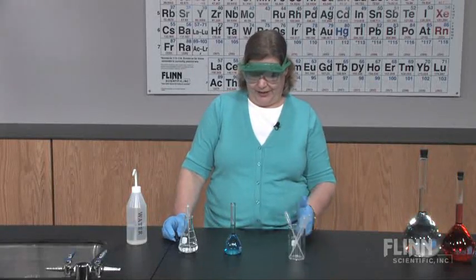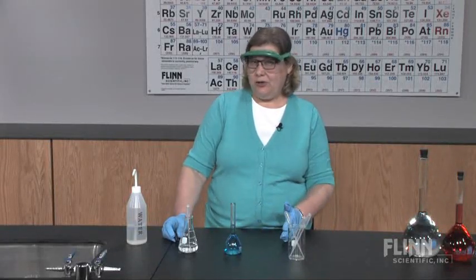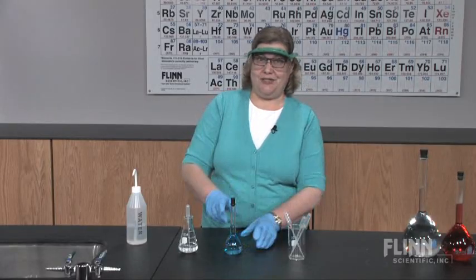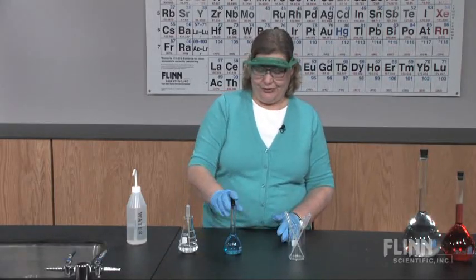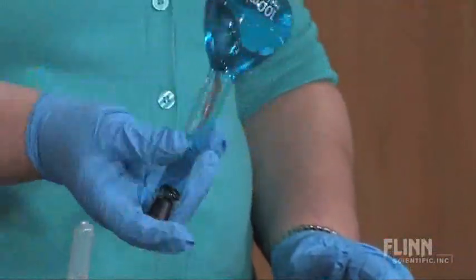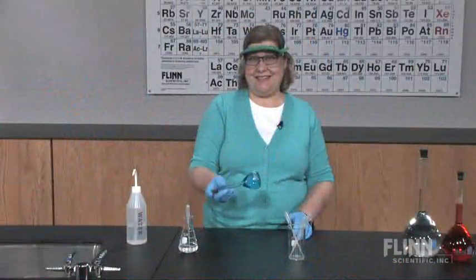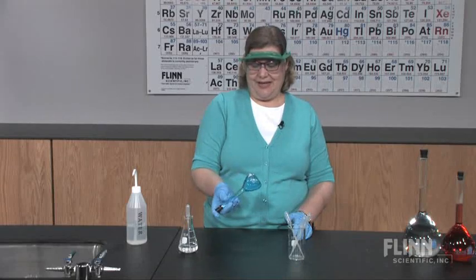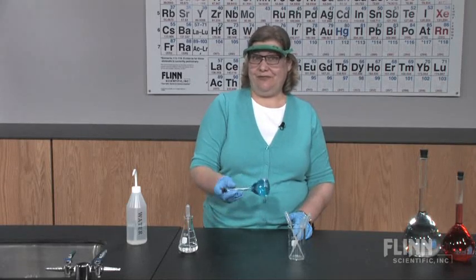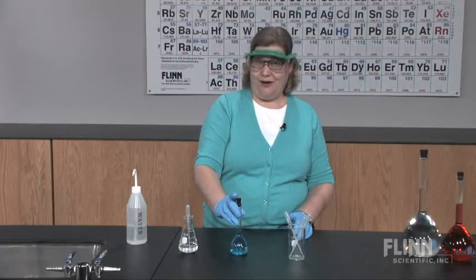Something many people forget: with the narrow neck, how do you thoroughly mix the solution to ensure a uniform concentration? The technique I learned was to stopper the flask and invert it 25 times to ensure thorough mixing. And yes, I do count — silently to myself. When accuracy is important, volumetric flasks are a lifeline.